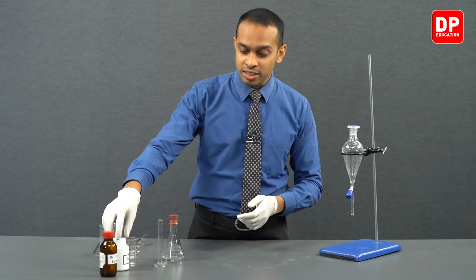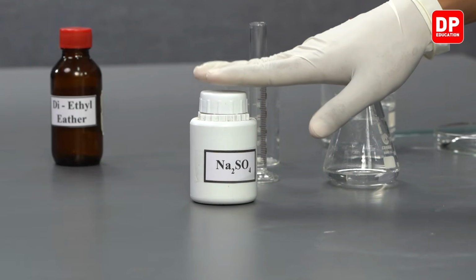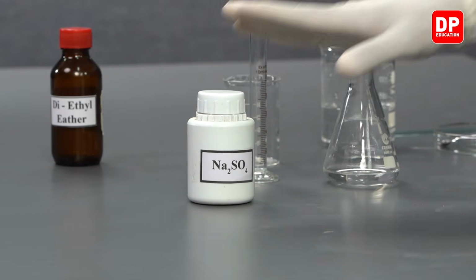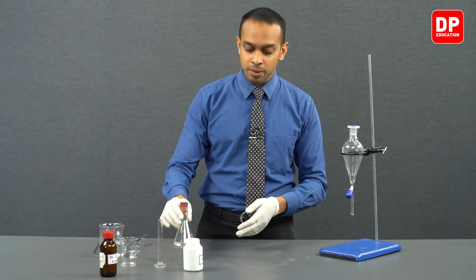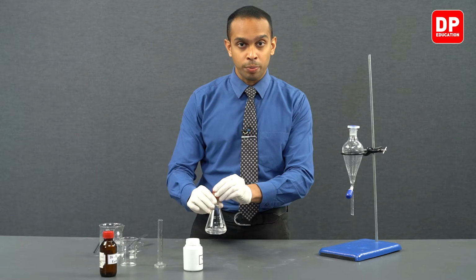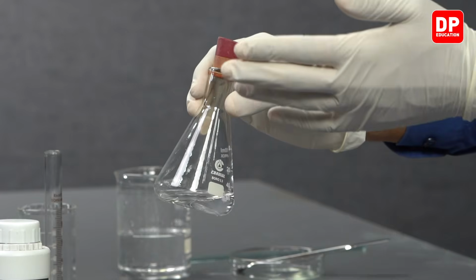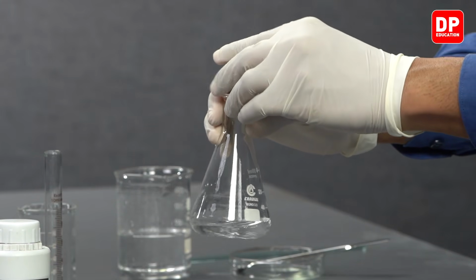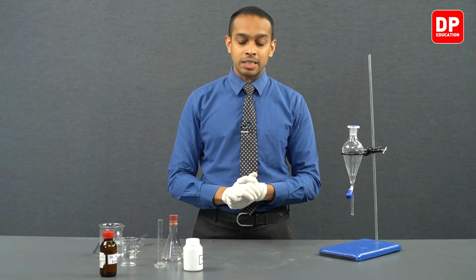Over here we have a drying agent, sodium sulfate, or more accurately we have anhydrous sodium sulfate in front of us here. So we are going to be taking this anhydrous sodium sulfate and we will transfer a small amount of the solid into this diethyl ether layer. The reason why we have closed this with a stopper, as I mentioned earlier, is because diethyl ether is very volatile and it might get evaporated if we keep it without placing a stopper on the Erlenmeyer flask.